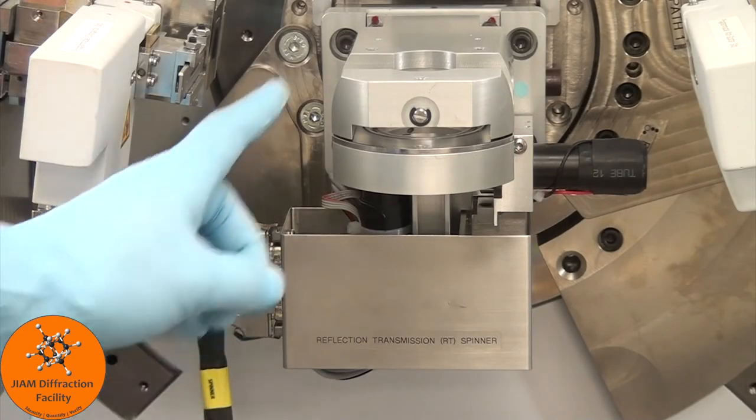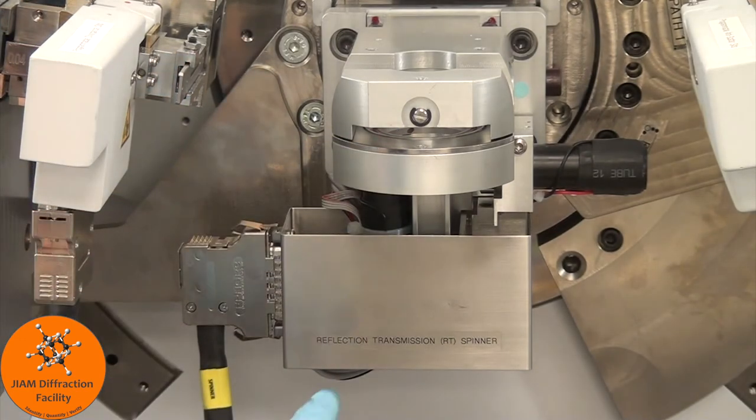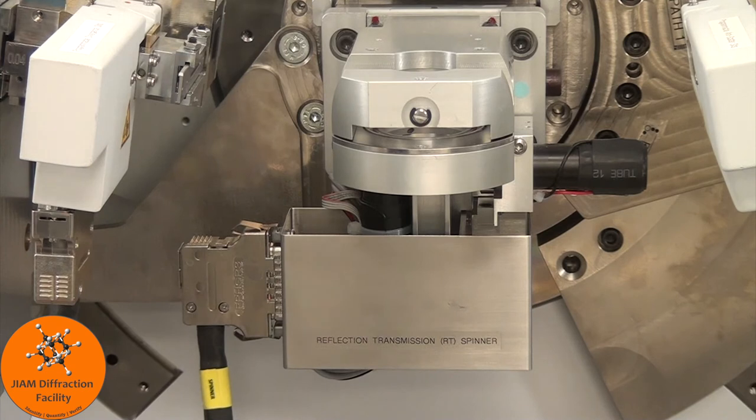Next, we have the sample stage, which is where your sample will sit during the experiment. It is called the reflection transmission spinner stage, and that is pretty self-explanatory. We can perform reflection experiments, transmission experiments, and it will also spin your sample to bring more crystallites into the X-ray beam.